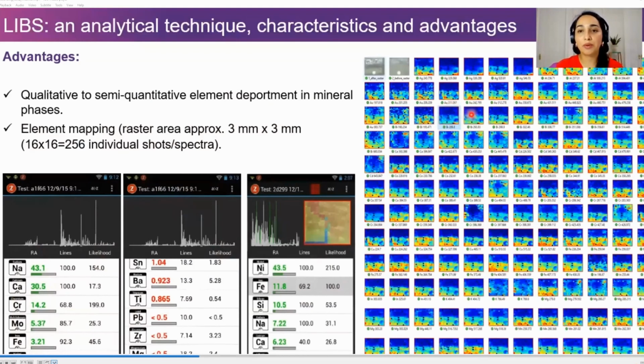It is also important that for each element, LIBS has a library with several emission lines. So it is really important to recognize what kind of emission line is the best for your interpretation and result, and it also depends on the geological and mineralogical context.